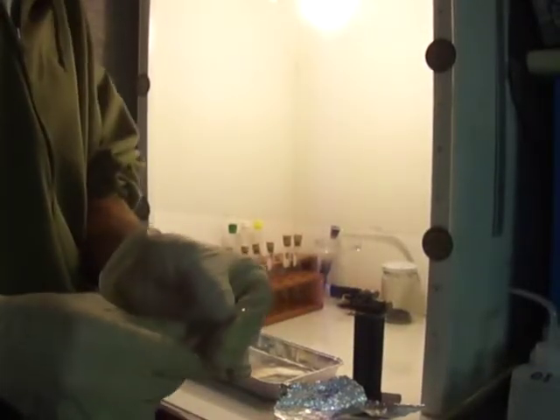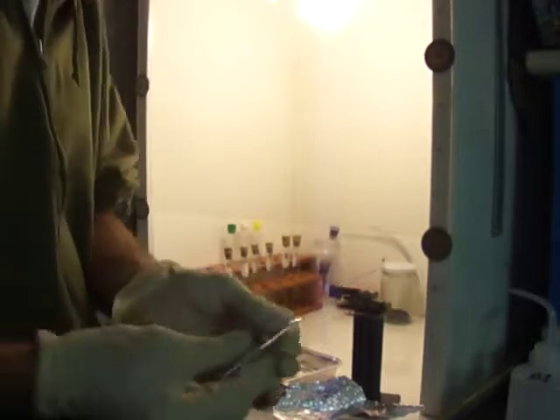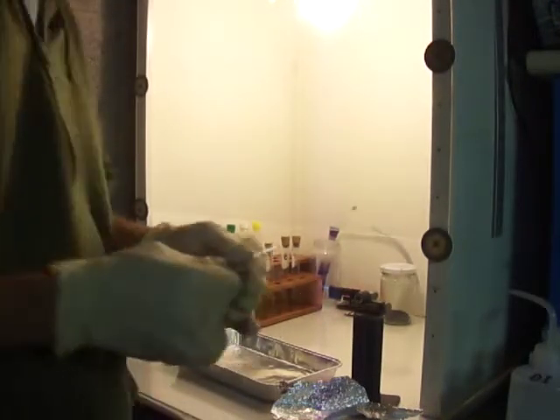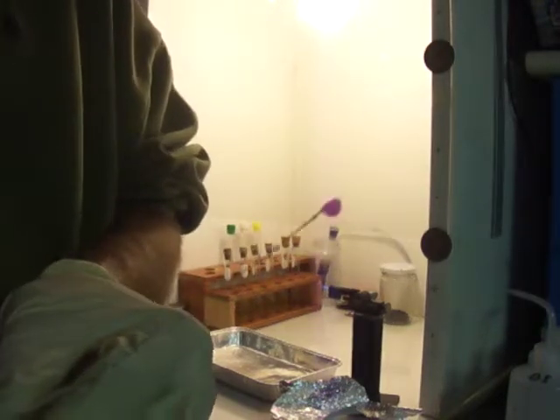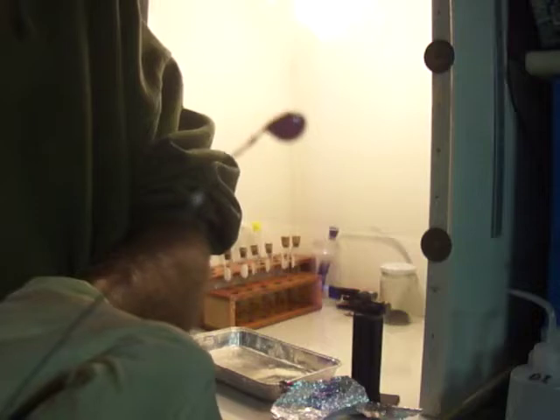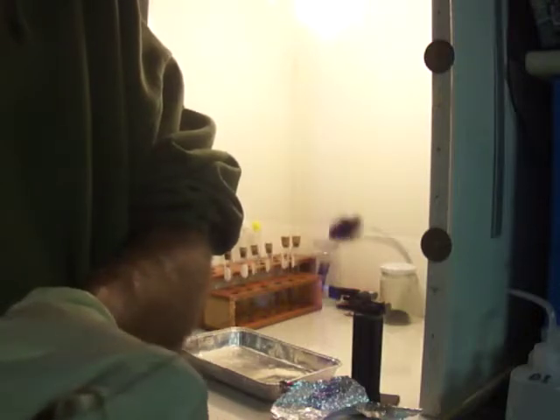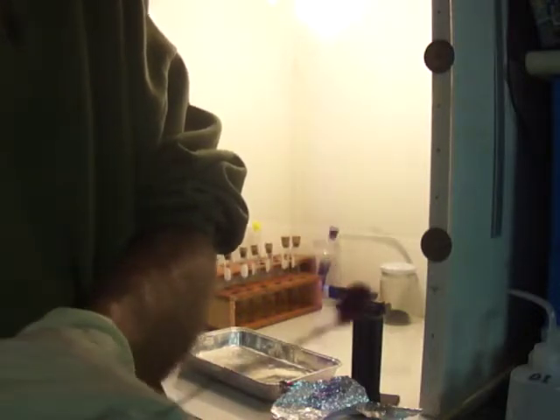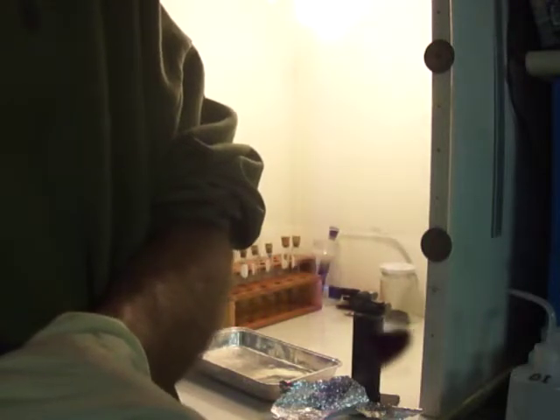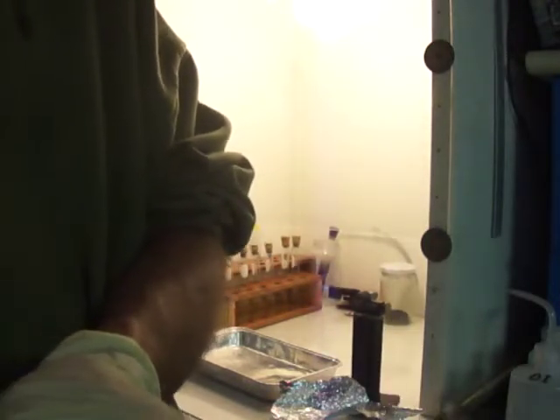Looks like I have a nice clear bead, so I'm going to dip it into a little bit of the sample. Okay, the bead is quite orange-red when it's hot, and it's turning a deep red, almost black, when it's cool. So that to me indicates that it's manganese. But we'll go ahead and do some of the other testing here and find out.